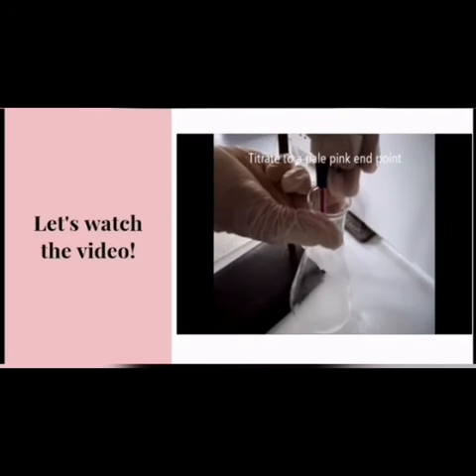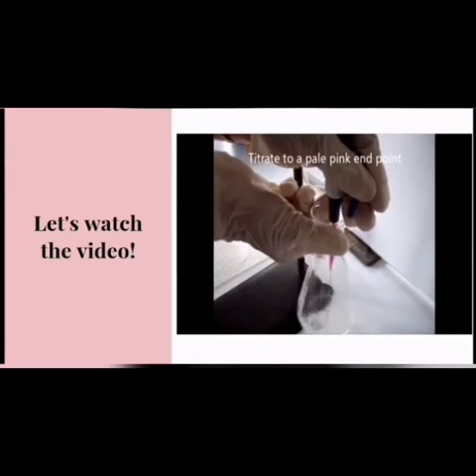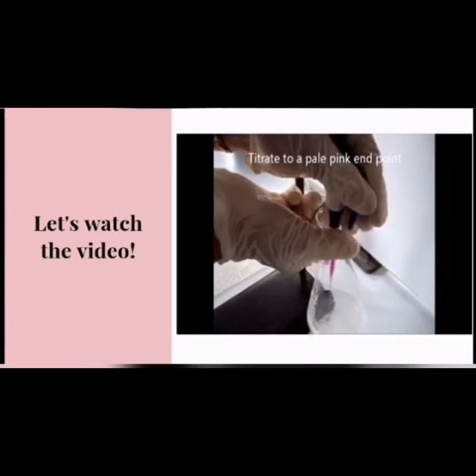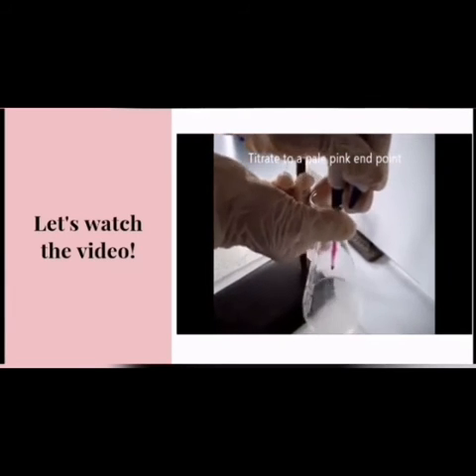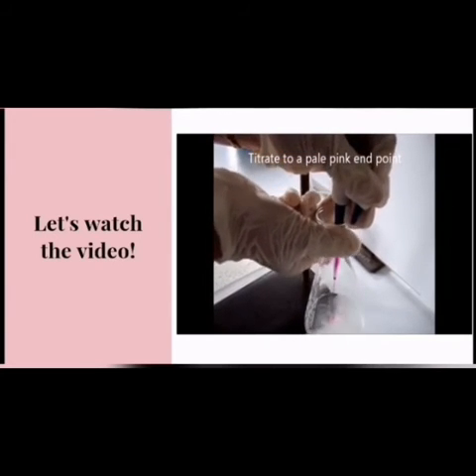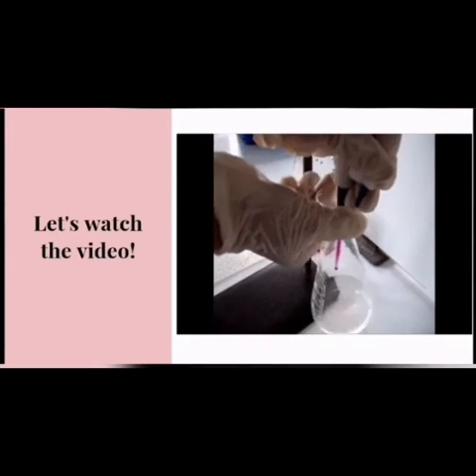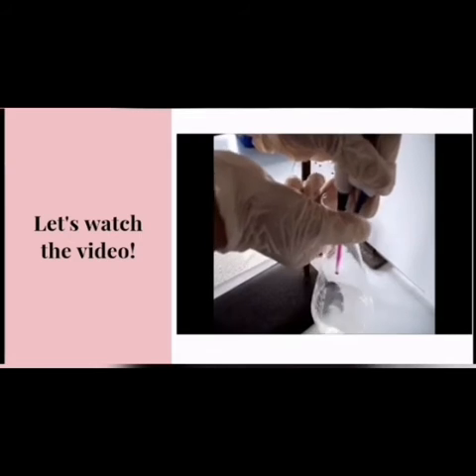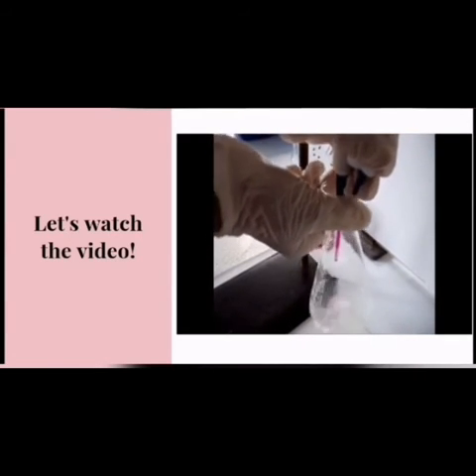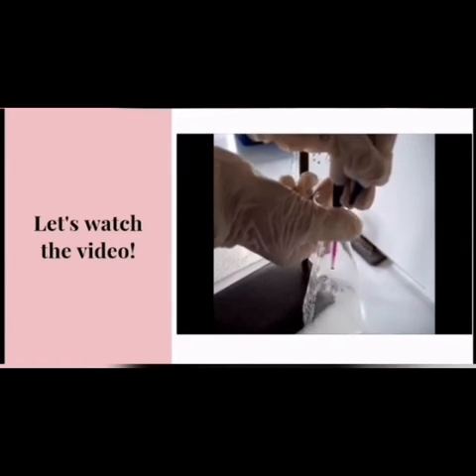A white tile was placed underneath the flask so that any color changes can be clearly observed. The iron solution was titrated with potassium permanganate solution from the burette. During the titration, the flask was continuously swirled. Upon reaching the end point, a temporary pink color appeared but faded when the solution was swirled. Continue titrating until a pale pink color persists for more than 30 seconds. That was the end point. The final burette reading was recorded to 2 decimal places. The titration was repeated 3 times.